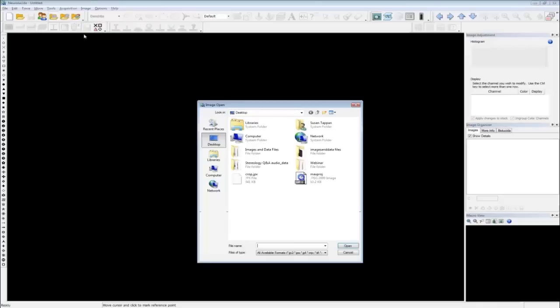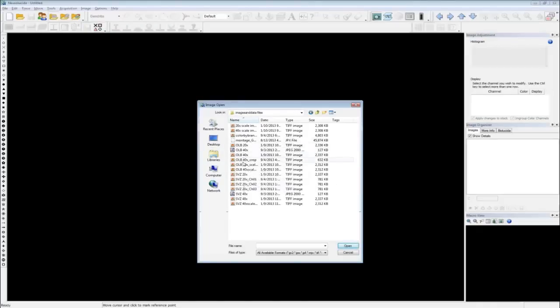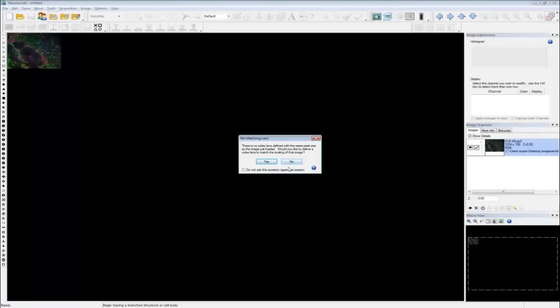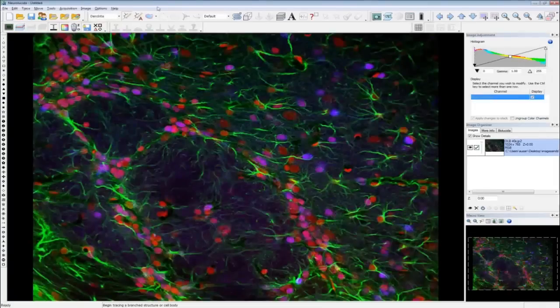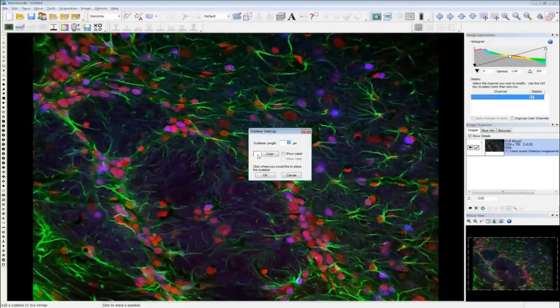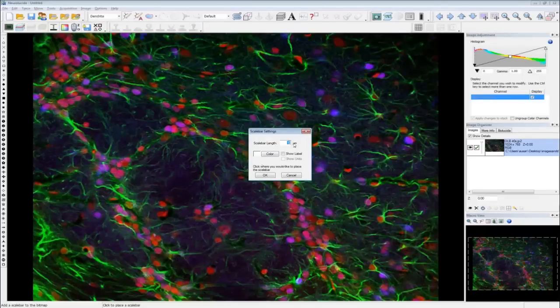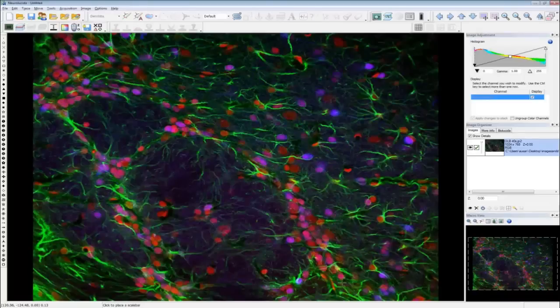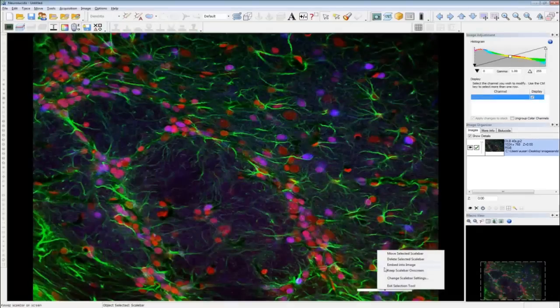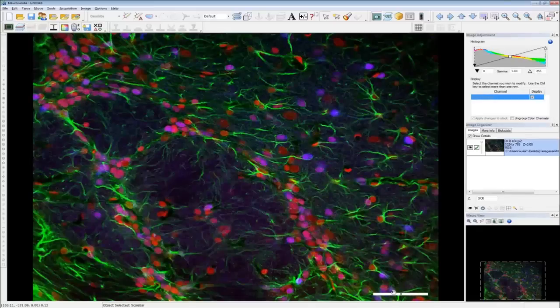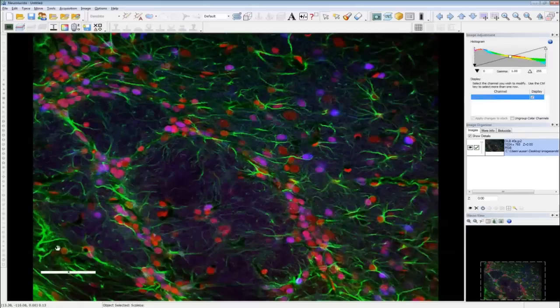To demonstrate, we'll go to Neurolucida and bring in an image. With the image displayed at the proper resolution, go to Edit > Add Scale Bar. You can set the color — black, white, aqua, your choice. For a 40x image, a 25-micron scale bar is appropriate. Click to place the scale bar. If you want to modify it, select the object just like a branch or contour and move it around — from the right-hand corner to the left-hand corner, for example. You can also right-click to change scale bar settings and update the color after the fact.